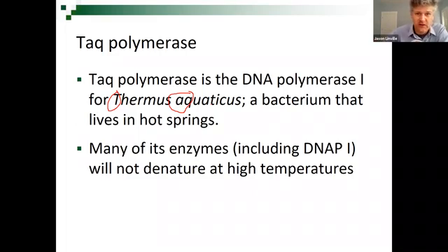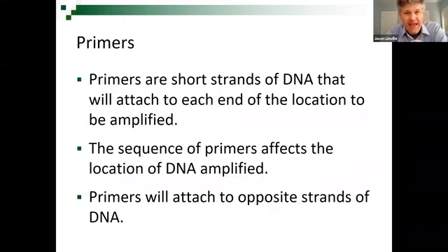So in my questions and on the exam, again, what are the 4 things in a tube? You can give me either answer. But if I'm asking you about the enzyme that does not denature at high temperatures, human DNA polymerase is not the right answer there. It's Taq polymerase, okay? So you order Taq polymerase, squirt it into the tube as one of your 4 components, and you just let that PCR cycle progress. You don't have to add new Taq in each cycle.